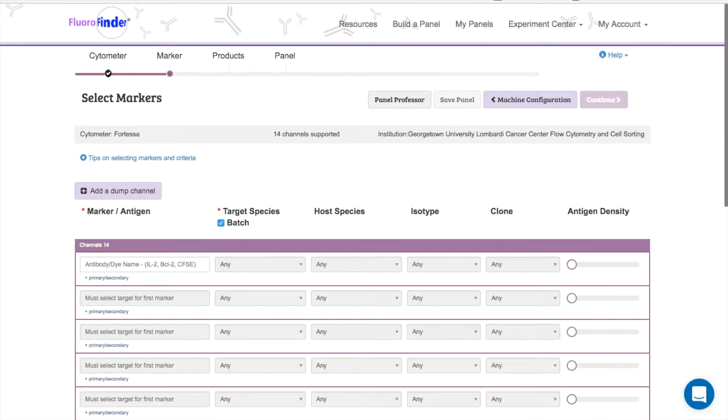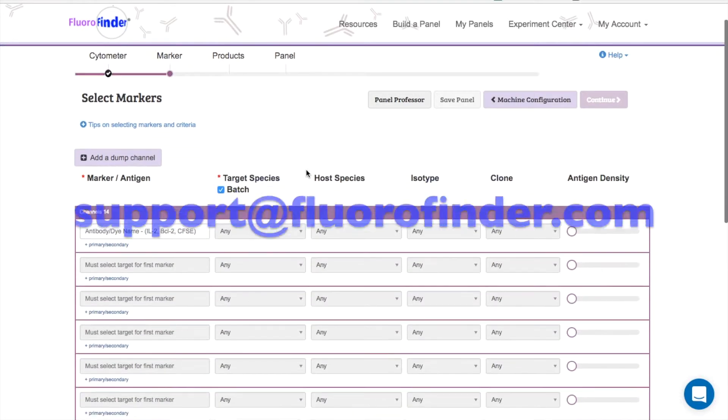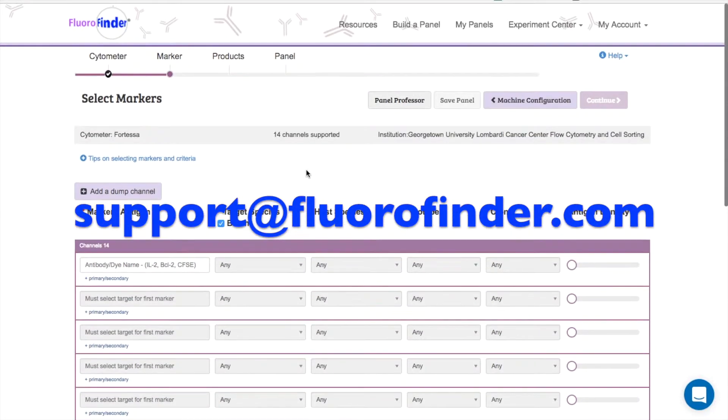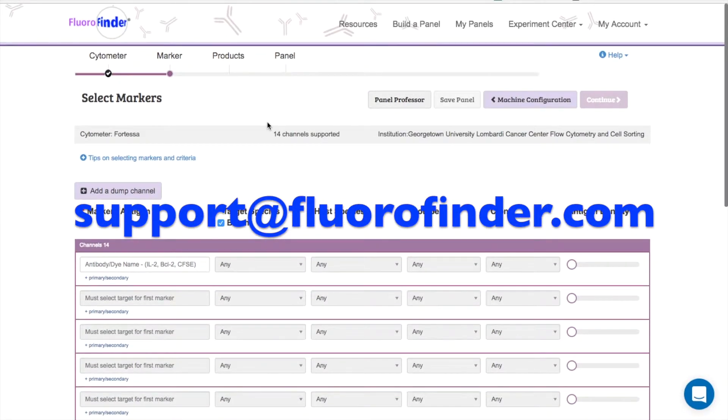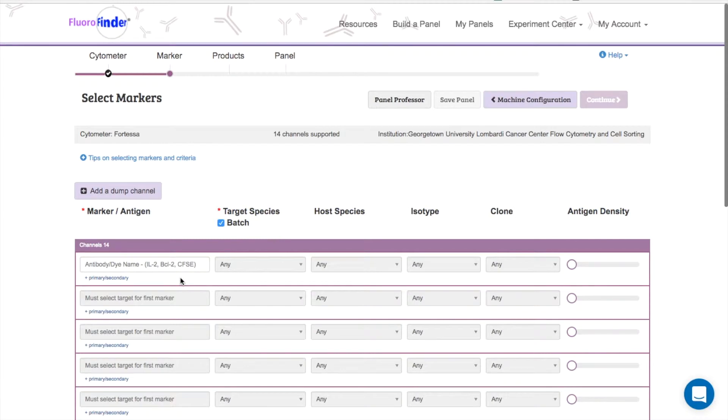If you can't seem to find your facility listed, there's a chance we don't have your machines in Fluorofinder yet. Send all of your configurations to support@fluorofinder.com and we'll upload them for you.